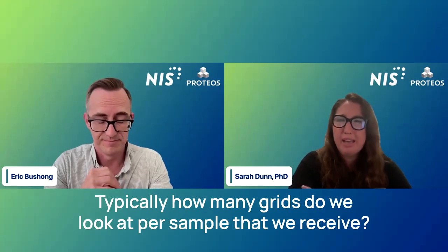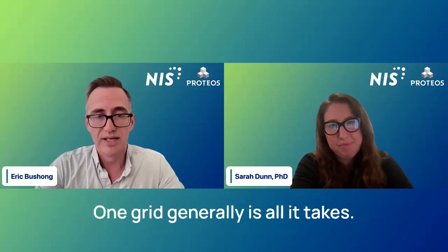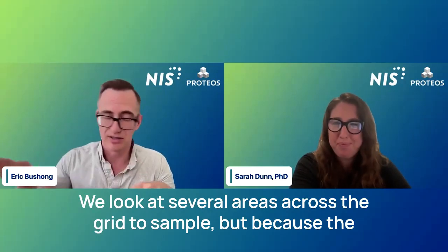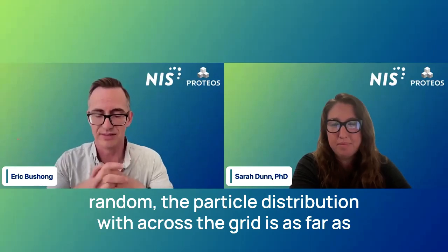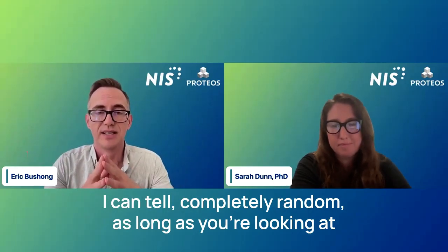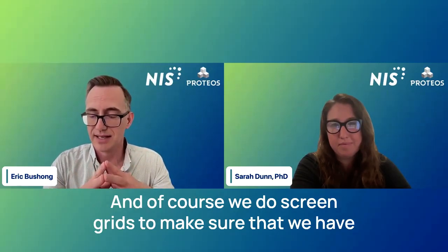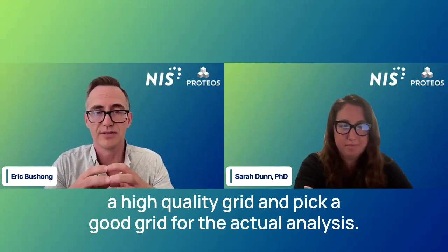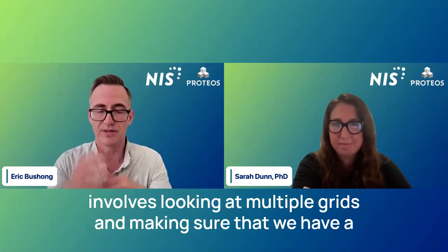Great. Typically, how many grids do we look at per sample that we receive? One grid generally is all it takes. We just make sure we look at enough particles from that one grid. We look at several areas across the grid to sample, but because the particle distribution across the grid is, as far as I can tell, completely random, as long as you're looking at enough particles, you should be sufficiently sampling the sample. And of course, we do screen grids to make sure that we have a high quality grid and pick a good grid for the actual analysis. And if we validate for GMP, of course, then the validation process involves looking at multiple grids and making sure that we have a consistent result across grids.